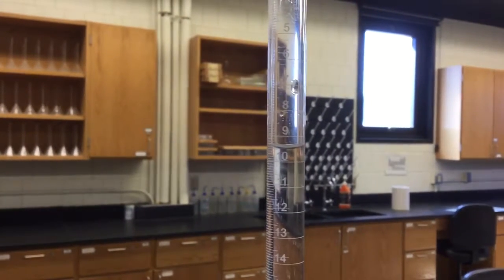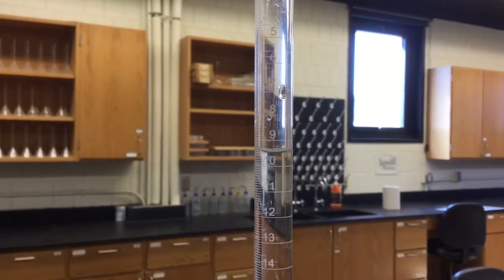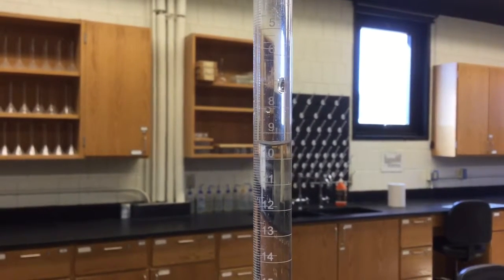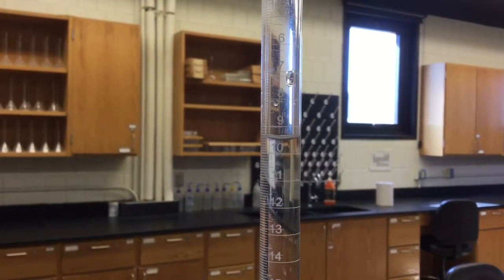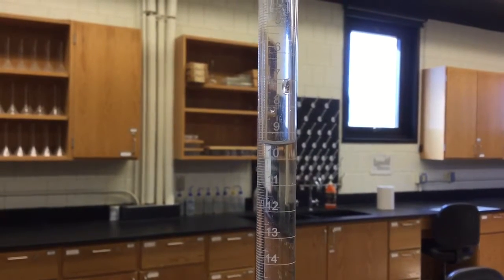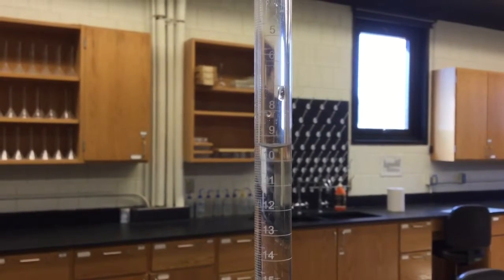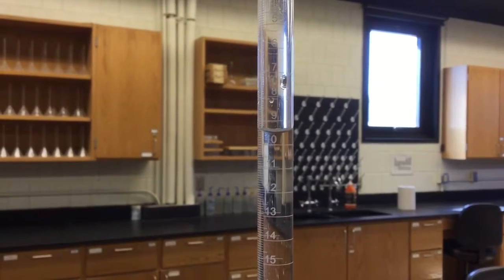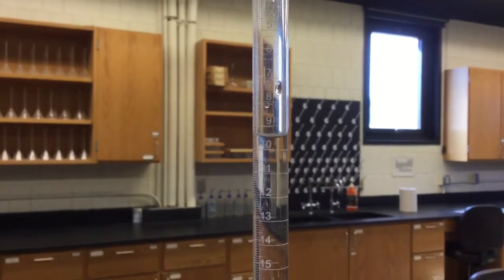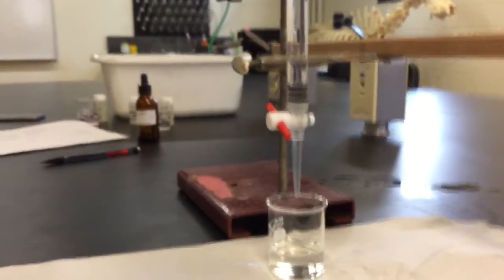The first thing we would do is determine our start point for the solution in the burette. As you can see here, the meniscus is about at the 9.5 milliliter mark, so I went ahead and wrote down 9.5 milliliters as my starting point. The solution inside the burette is 0.1 normal sodium hydroxide.